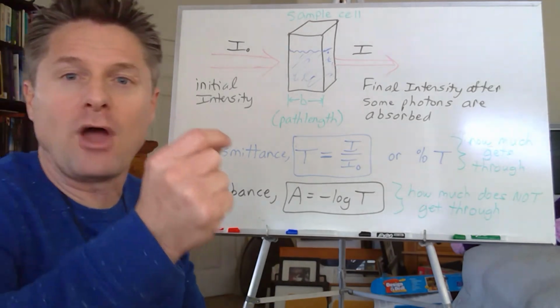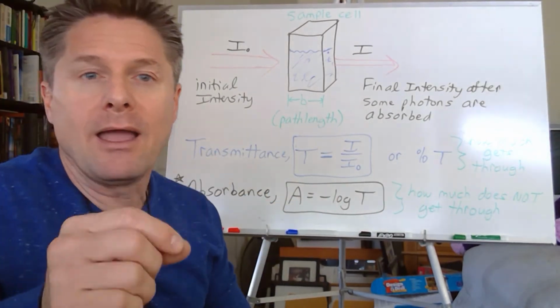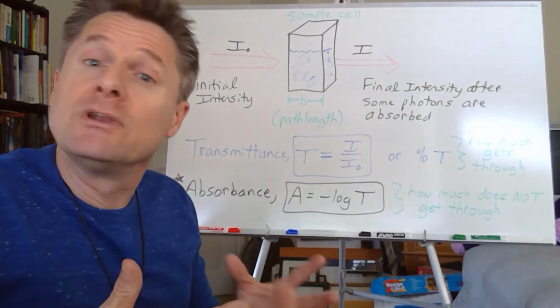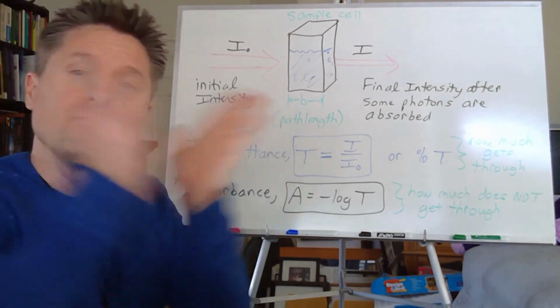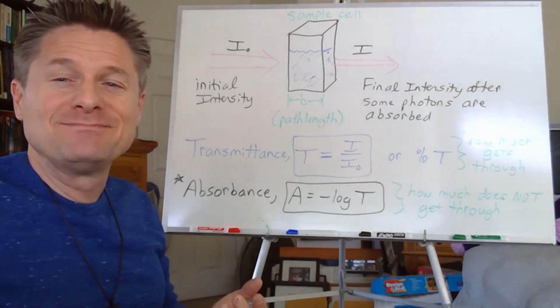You'll see on the spectrophotometer, it'll say something like 0.721 ABS, just absorbance. But that's really not a unit. It is a unitless quantity. So I put a little star here. We're going to be doing absorption spectrophotometry. Let's start looking at this equation we're going to get to. Be right back.